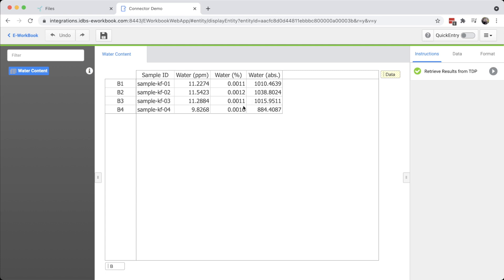From here, since everything looks good, I can save the spreadsheet and continue with my analysis now that I have everything I need in my notebook.